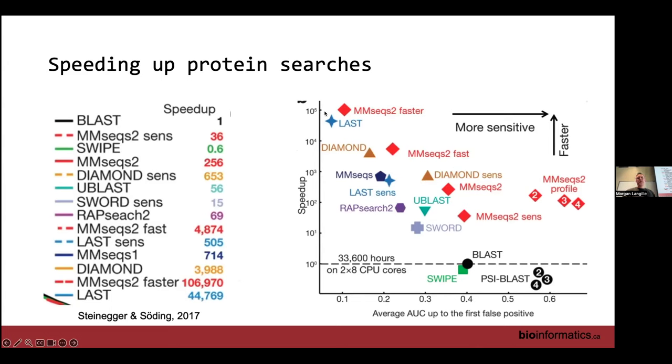We have just sort of ignored the whole virus thing. And so the functions and taxa that we've talked about a lot are sort of ignoring those. But obviously, if you're interested in phage, prophage, or other types of viruses, you would be doing other types of similarity searches. There's quite a few tools that pull out reads from your community so that then you can run some sort of analysis on. So VirSorter, you know, it tries to identify this is likely a virus sequence, and then you can annotate it after. But there's a lot of tools in that space as well.